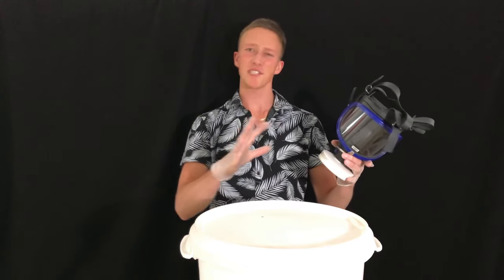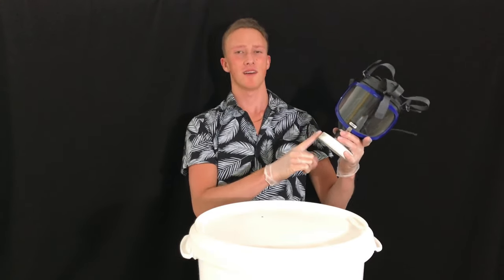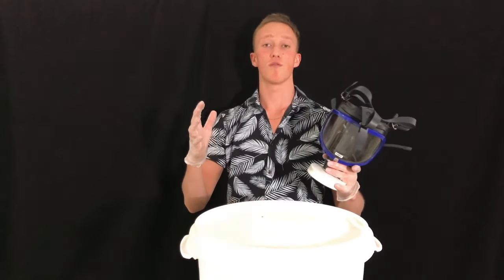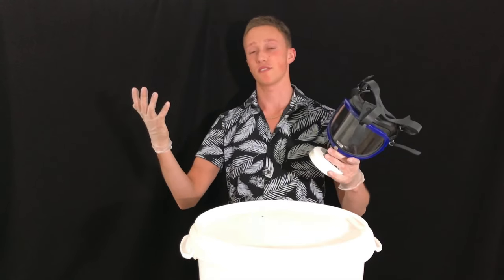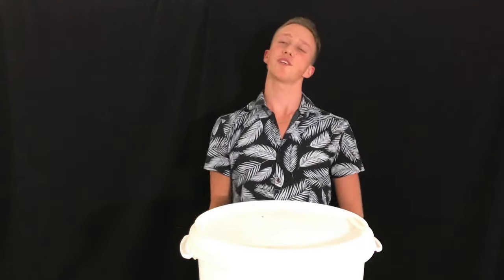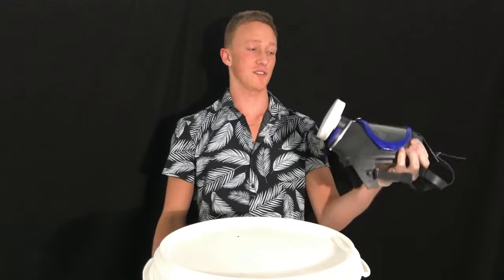When I'm inhaling any of these particles, I'm going to be putting on this gas mask equipped with a P3 rated filter. A P3 rated filter is basically a particle filter which is suited for very fine particles. By wearing this mask, we will be able to avoid inhaling any of these particles, and we're also going to be putting on these gloves, because I don't want the stuff on my hands, because this is going to be spread everywhere if I don't wear gloves, and I don't want that. So let's put on the gas mask, open up this big bucket, and first take a look at what fumed silica actually looks like. I've actually never used this particle filter before, because I mainly deal with toxic gases and not with toxic particles.